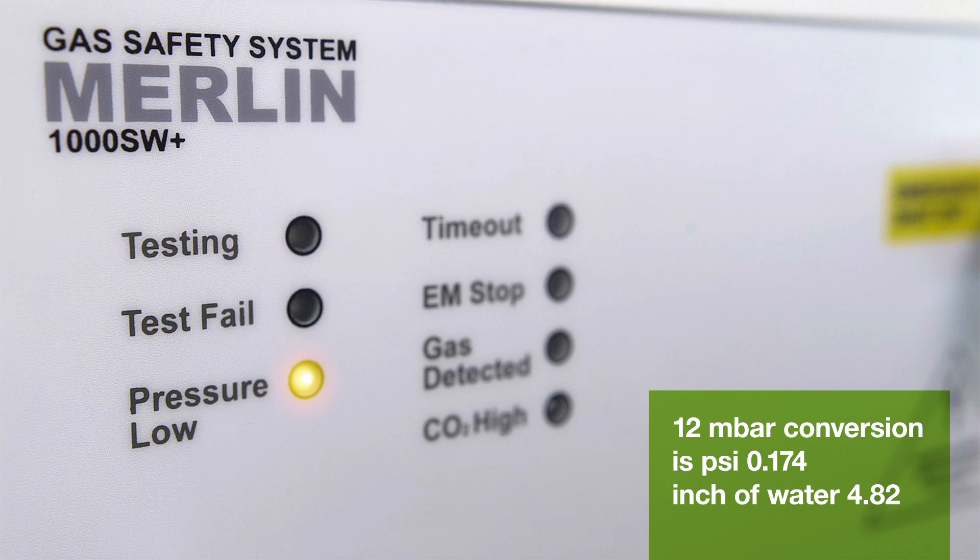This way we are protecting the class from weak flames, which can be easily extinguished by drafts. Once the low pressure situation has been resolved, the panel is reset using the authority key. And once gas is selected, the panel will perform the pressure drop test to ensure that all the turrets are in the closed position.